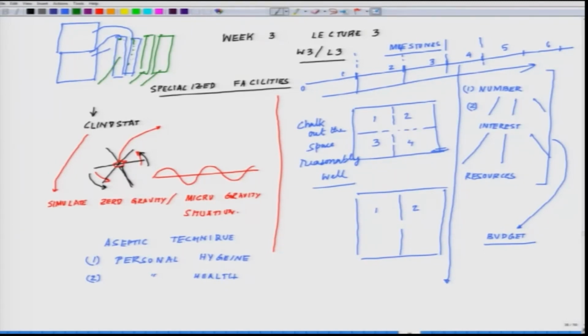The day you fix these cylinders, maintain a logbook, and on top of that put a sticker telling that fixed on, say, day, month, year. So you have a fairly good idea whether it will last a month or 2 months or whatever. So you make it a scheduling. It's a very scheduling problem which most of the people forget.